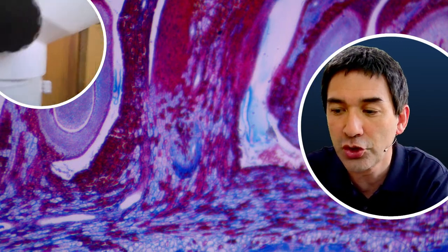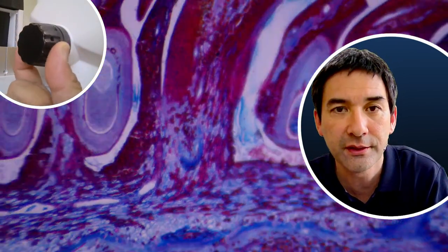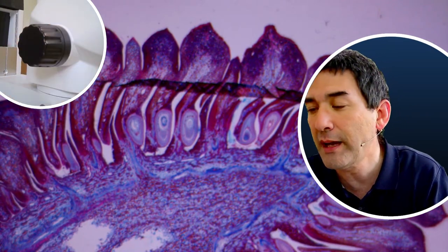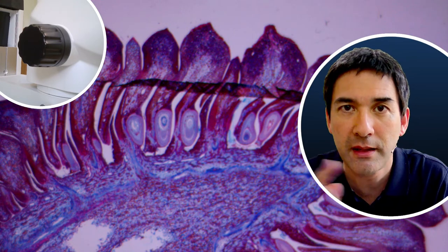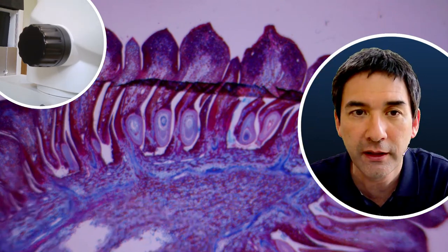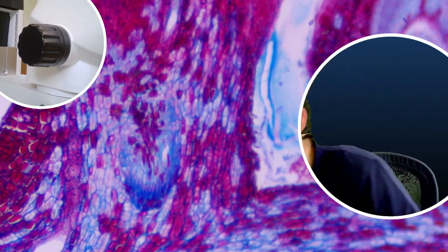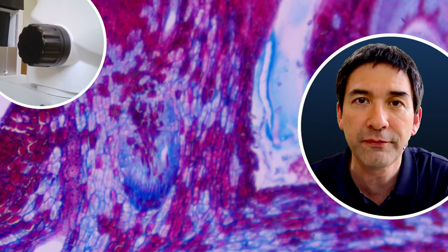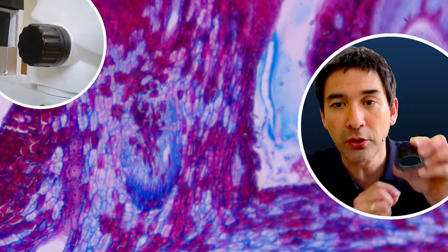Let's look at the stereoscope. I can change magnification by turning a knob. The lowest objective magnification is 0.65 — so with a 10x eyepiece, I'm getting 6.5x magnification. If I go all the way in, the maximum is 5.5x objective times 10, giving 55x magnification. By adding the Barlow lenses, I can go over 100x, but then it will be quite blurry.